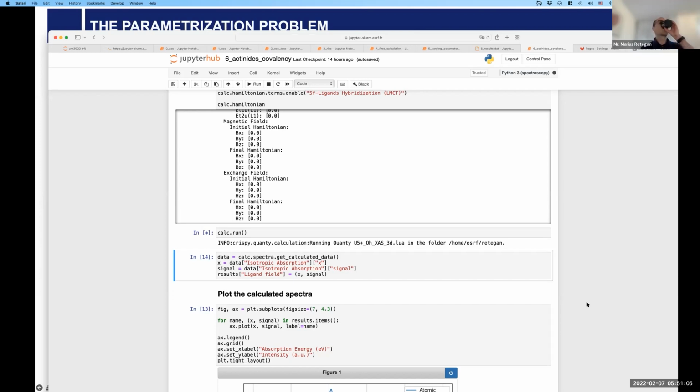Well, it's quite clear what you do. You get your data, you make a baseline subtraction, you make a Fourier transform, you do a FEFF calculation, you fit the thing, and then you get your data, if you do a standard EXAFS, which follows the same procedure as in Athena. In this kind of programs, I'm sure you can also do that, but it's a little bit not user-friendly enough.